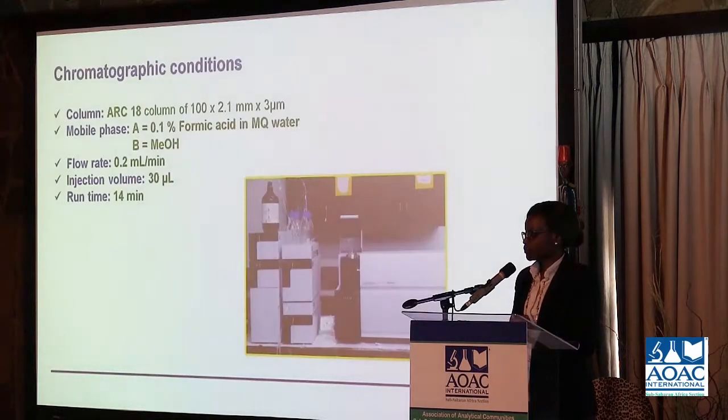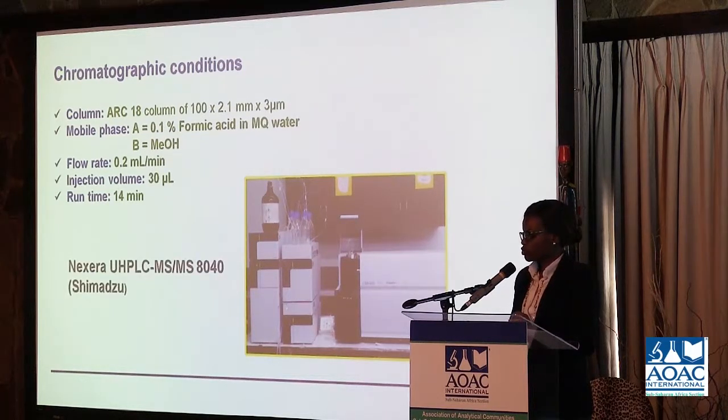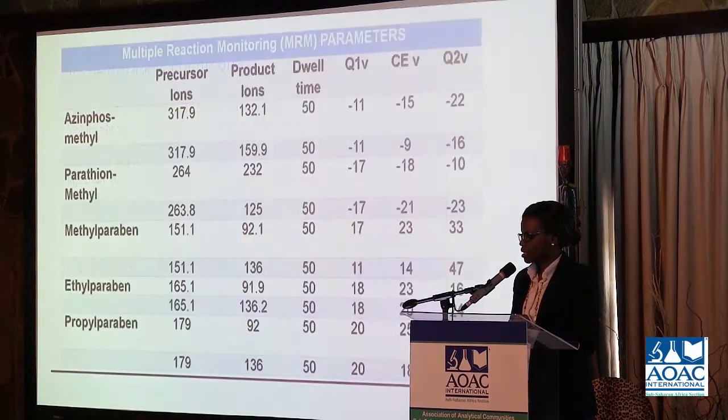For the instrumentation part, I use LC-MS/MS. That is the instrument that we have in our laboratory. It's a Shimadzu UHPLC MS-8040. And these are the conditions: the column, the flow rate, and the mobile phase.